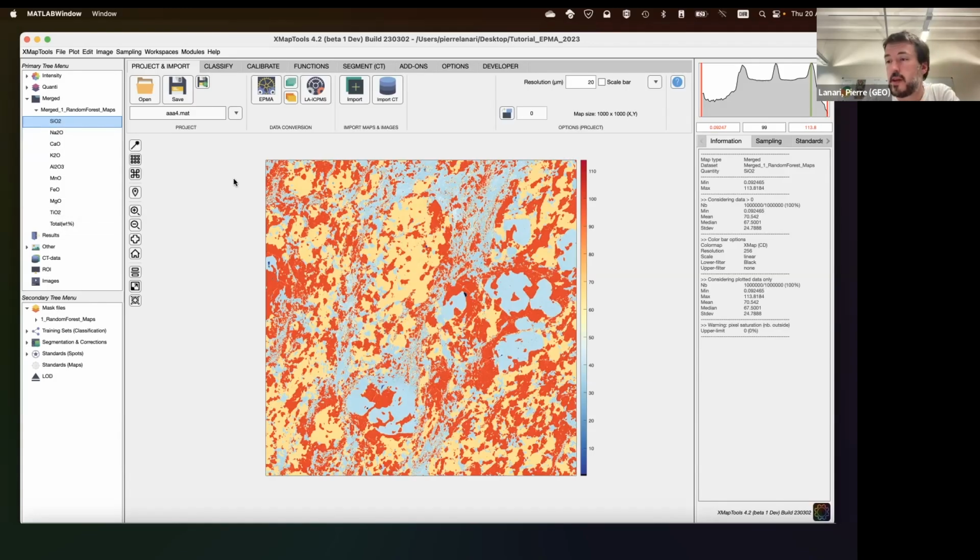So to generate the local bulk composition, what we have on this image is for every pixel a weight %. And then what we know is the surface of our pixel. If we want to calculate a bulk composition, we need to know the surface % of the minerals, the composition of each pixel, and by assuming that we know volume, try to calculate this bulk composition.